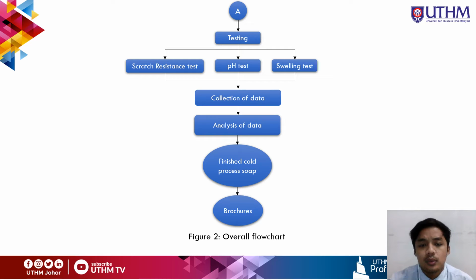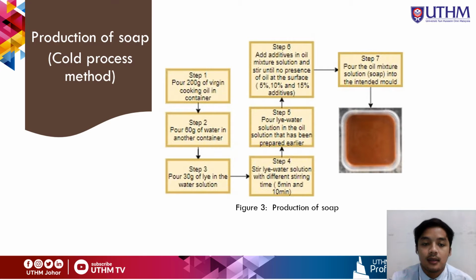After the test, we will collect and analyze the data, and also the soap produced by using the cold process method. We will also prepare and produce the brochure. Okay, so these are the steps to produce the soap by using the cold process method.